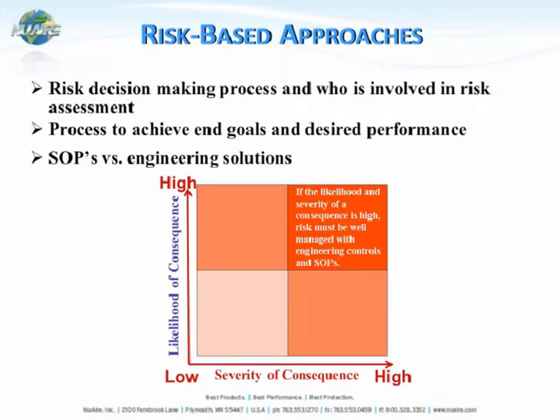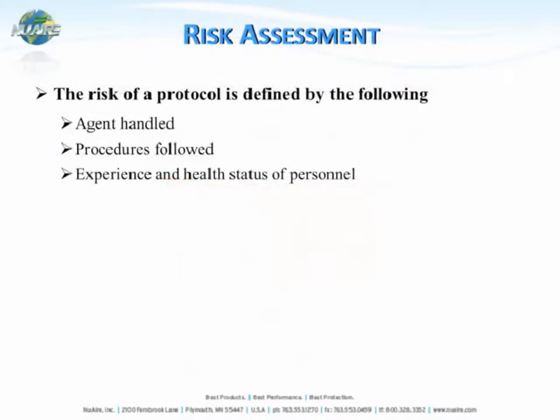When looking at risk, there are different risk-based approaches to take. The biggest things are to look at the likelihood of the consequence and the severity of the consequence. If both the likelihood and severity are high, then risk must be well-managed with engineering controls and standard operating procedures. A risk assessment has several factors: the pathogen or agent handled, the procedures to be used, and the experience and health status of the personnel performing the work.